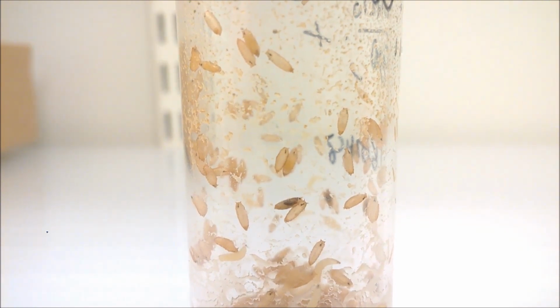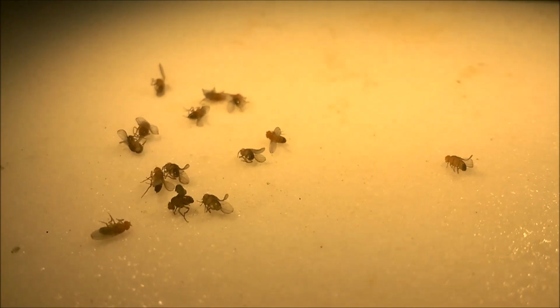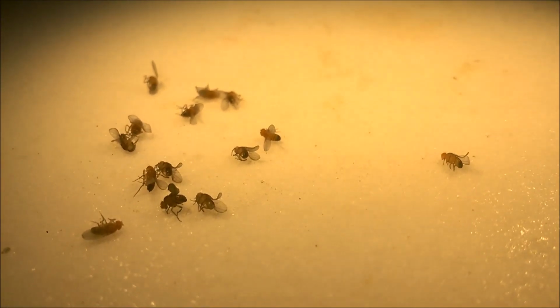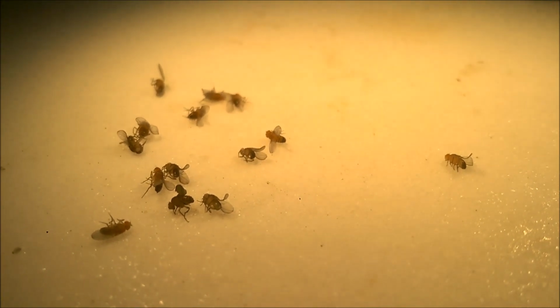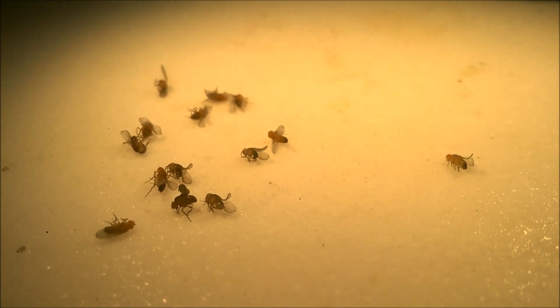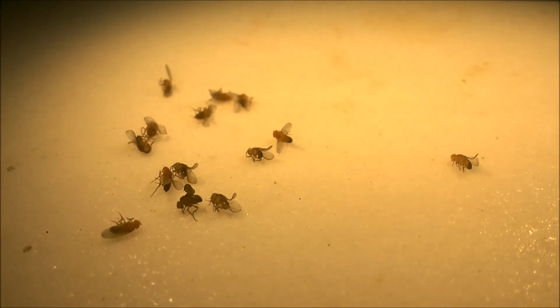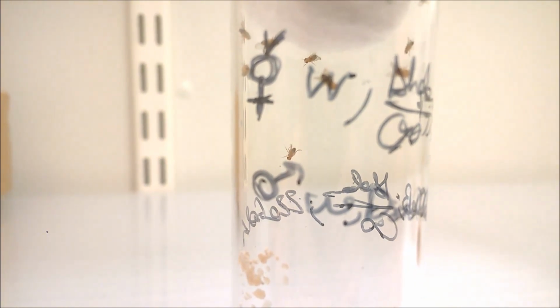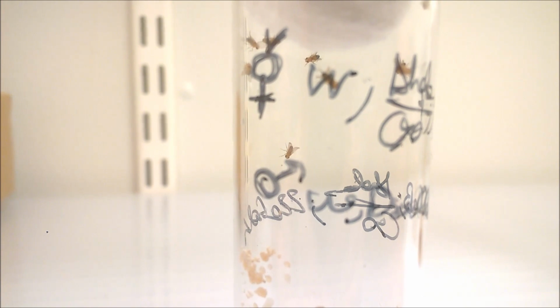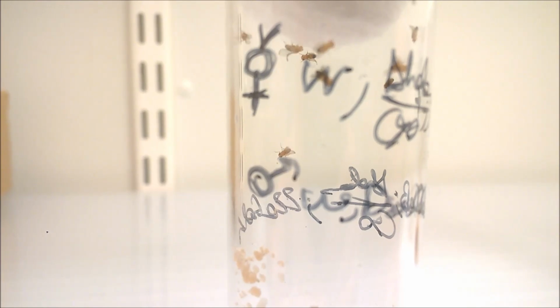This adult and all the other adults will be selected based on their phenotypic features. Very few insects are selected based on their phenotype. For instance, in this case, we selected the insect on the right based on its red eyes, curly wings, and some other little features like short and bristle hairs. Further crosses will be performed based on the genetic features of our insects, in order to have proper crosses with proper genetic features.